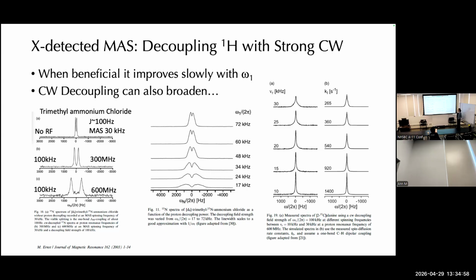There's more to it in the paper where he's actually exploring an underlying model or hypothesis for what's going on that has to do with spin diffusion. So the simulations I'm not really going to explain for right now, but you can see phenomenologically that it has nothing to do with what I just explored. So there's something else going on.